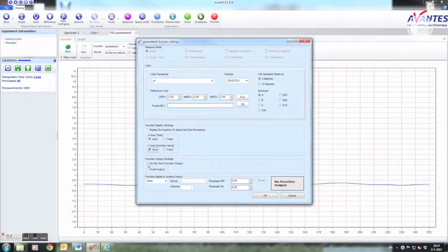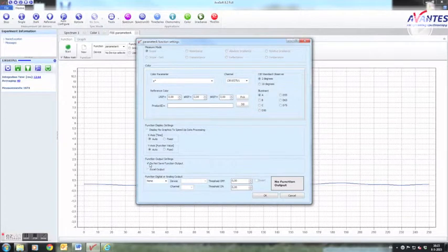Function output setting defines if and how the data is saved. You can save to a data file or to Excel.